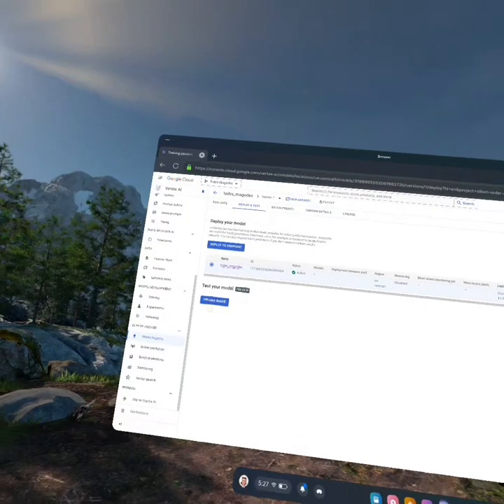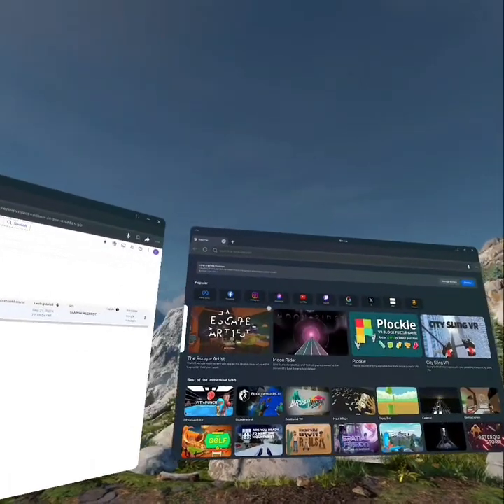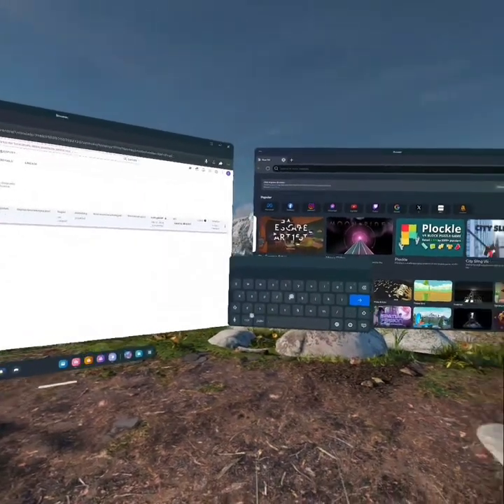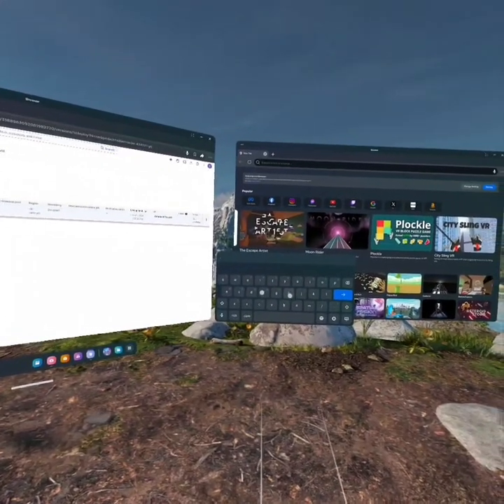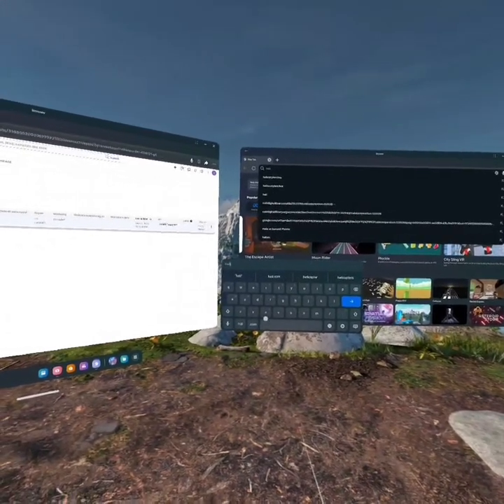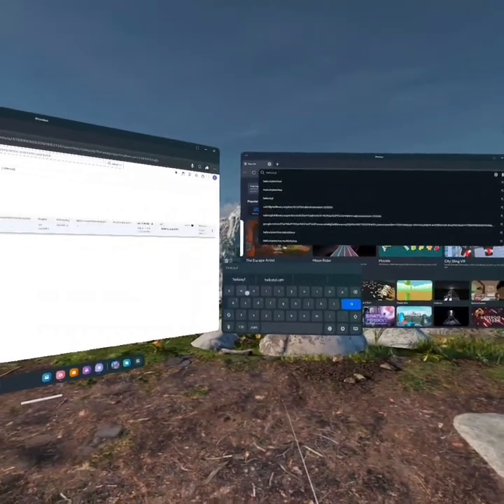All right. So I have to upload images, but what I'm going to do is just come over here and see Helicotylenchus.